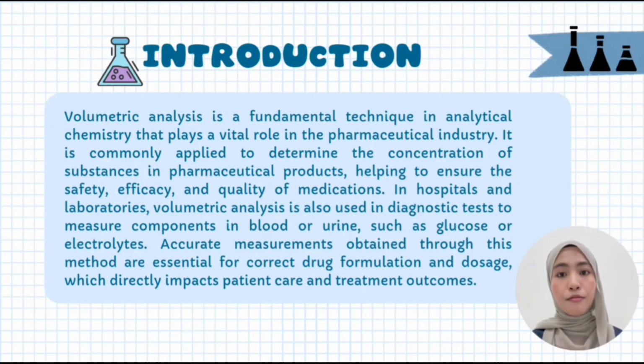Volumetric analysis is a fundamental technique in analytical chemistry that plays a vital role in the pharmaceutical industry. It is commonly used to determine the concentration of substances in pharmaceutical products, helping to ensure the safety, efficacy, and quality of medications. In hospitals and laboratories, it is also used in diagnostic tests to measure components in blood or urine, such as glucose or electrolytes. These accurate measurements are essential for proper drug formulation and dosage, which directly impact patient care and treatment outcomes.